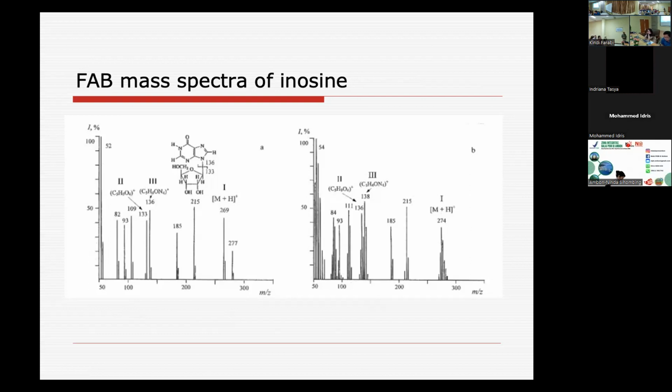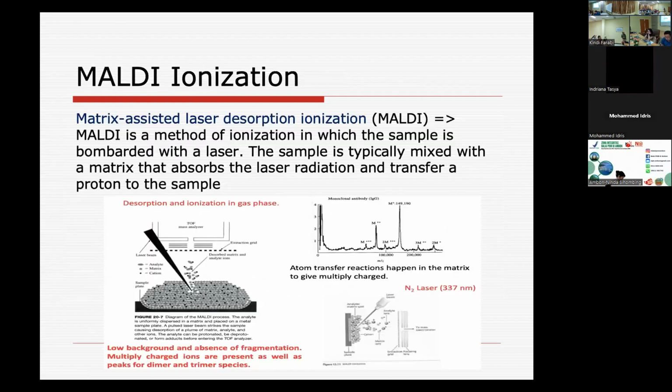Berikutnya, ini teknik MALDI tadi, ini juga matriks. MALDI ini biasanya untuk suatu protein. Matrix assisted laser desorption ionisasi atau MALDI adalah satu metode ionisasi yang mana sampel dibombardir dengan suatu laser. Kita menggunakan laser desorption. Biasanya kalau protein, lazimnya kita menggunakan teknik MALDI mass.